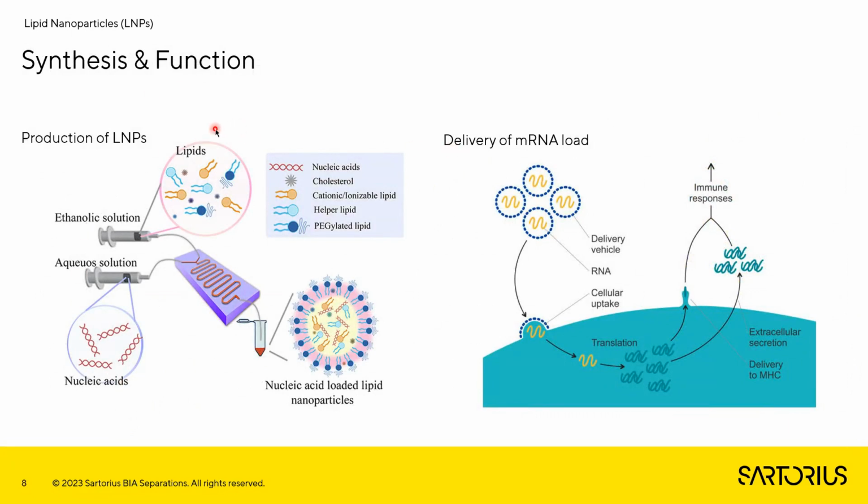So, a little bit about the synthesis and the function of lipid nanoparticles. Lipid nanoparticles are usually prepared in a quite simple process with the help of microfluidic mixing of two different solutions.